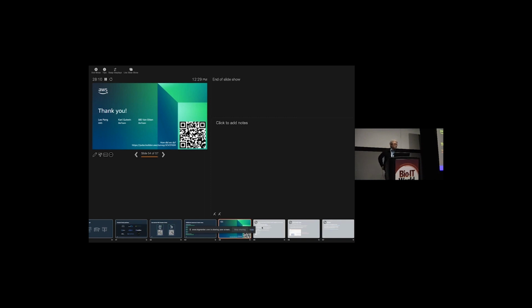Another question? For the loading of data from these genomic stores, the way that they're transferred is in a stream. So do all the downstream processes need to be able to accept a stream of data in order to function, or are they able to download the FASTQ and operate on it, which is the traditional model, whereas you might be able to stream it and save some of that overhead?